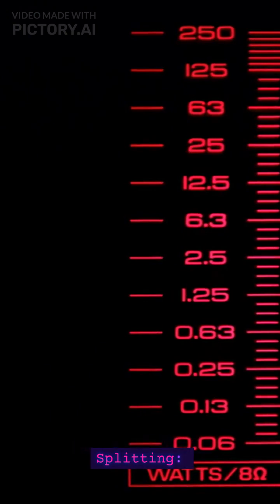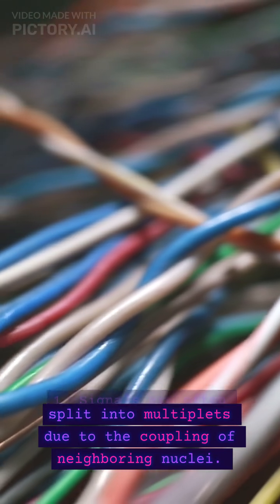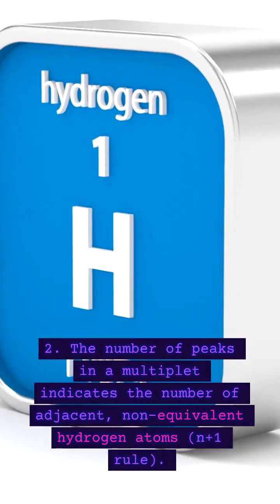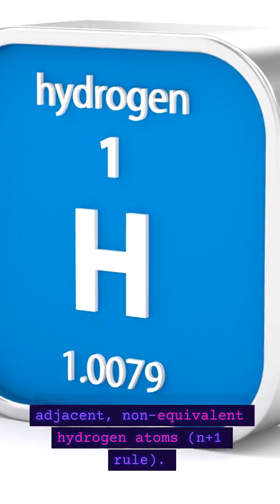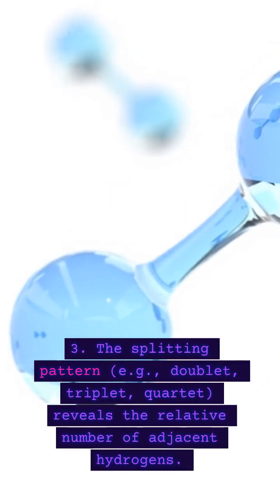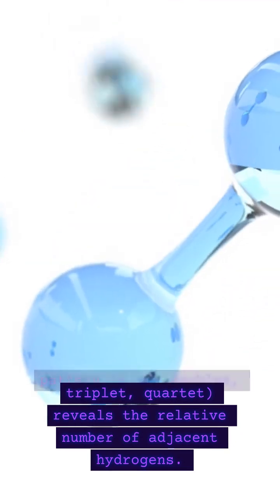Analyze signal splitting. 1. Signals are often split into multiplets due to the coupling of neighboring nuclei. 2. The number of peaks in a multiplet indicates the number of adjacent, non-equivalent hydrogen atoms, the N+1 rule. 3. The splitting pattern, e.g., doublet, triplet, quartet, reveals the relative number of adjacent hydrogens.